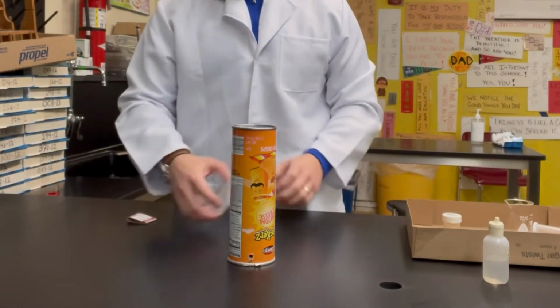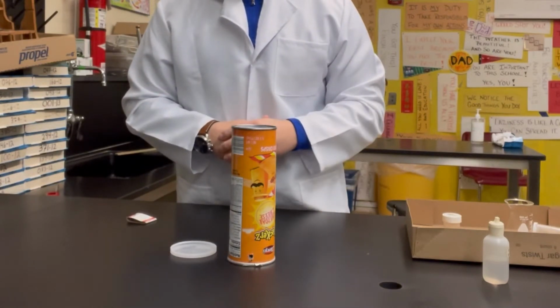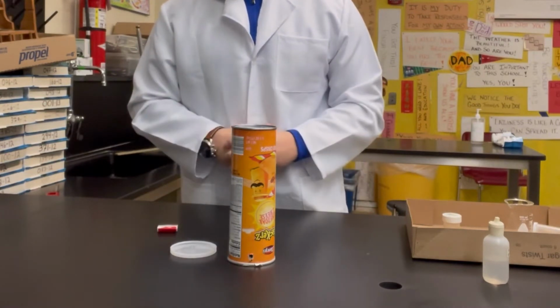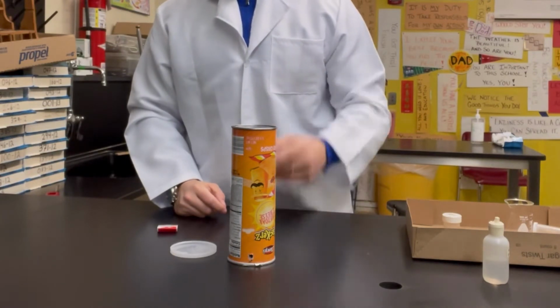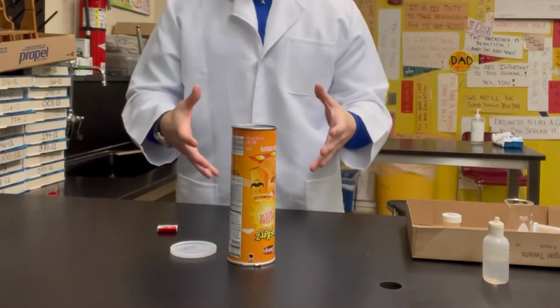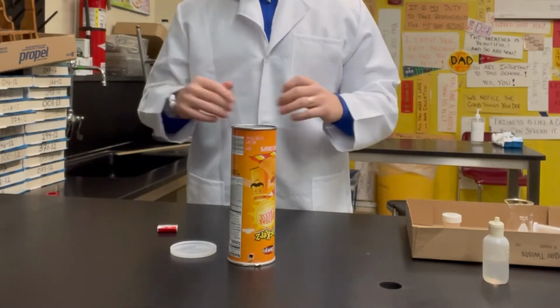Once we do that, we will then put on this lid and we'll test to make sure that hydrogen gas was formed. We're going to just take a little match, light it up to see if it actually ignites the hydrogen gas. So we'll wait here, we'll let that hydrogen gas collect, and then we'll try it out. While we're waiting for that hydrogen gas to build up, let's look at the actual single replacement reaction going on between zinc and hydrochloric acid.